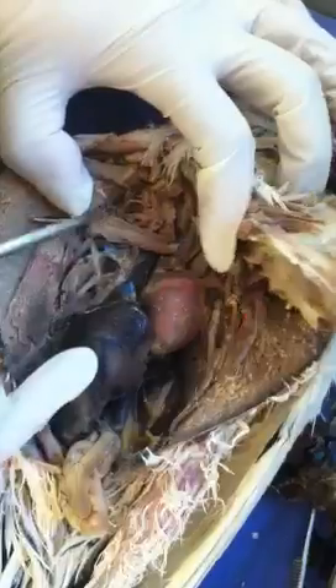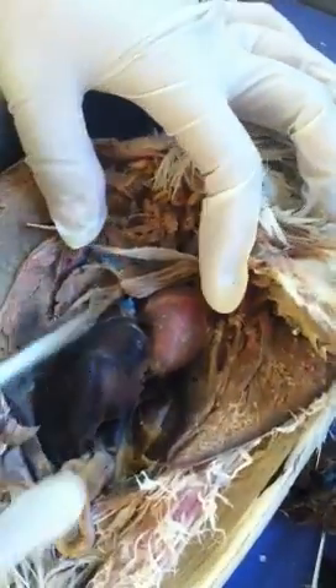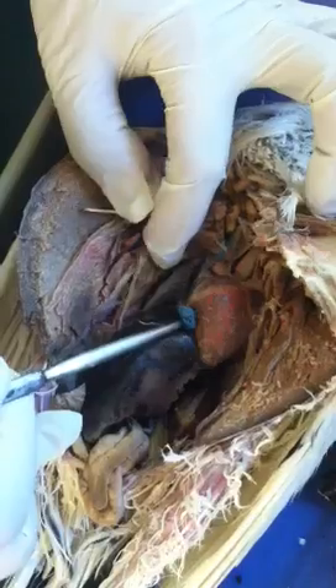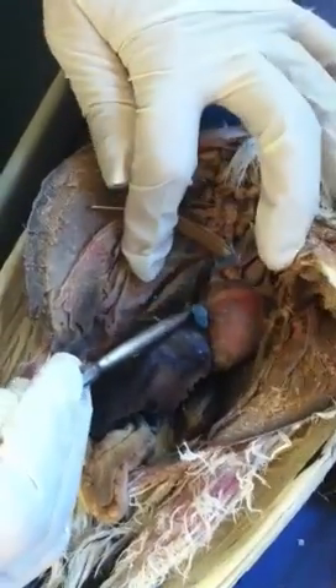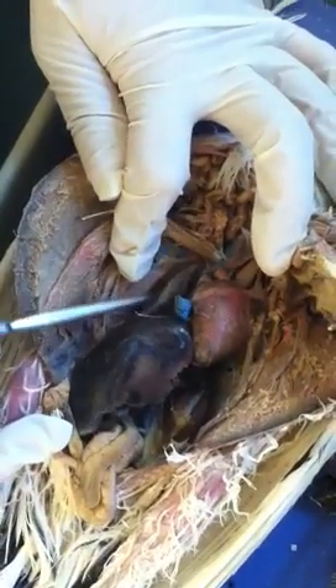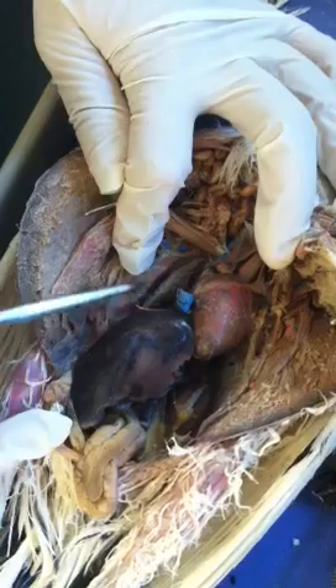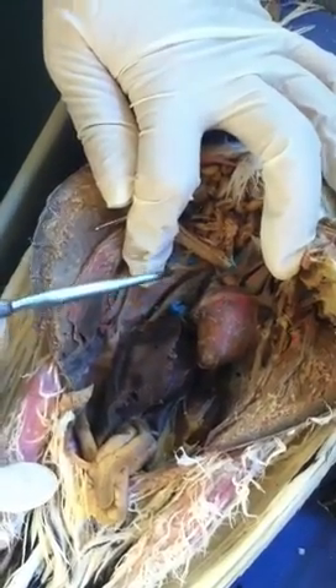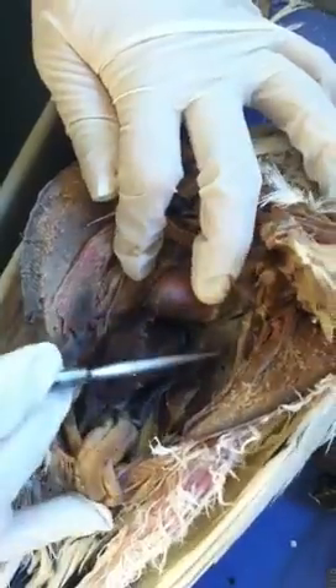The last organ I want to show you is the lungs. It's kind of hard to distinguish from other organs, but it's right by the heart. You will see the orientation of the organs: heart, liver, and lungs — one lung on each side.